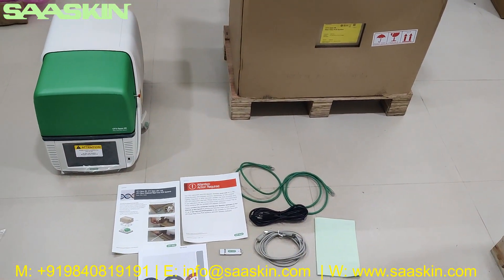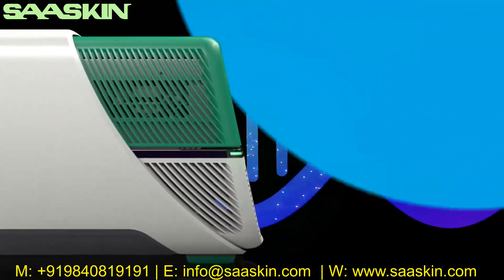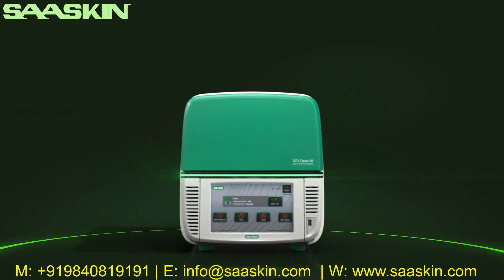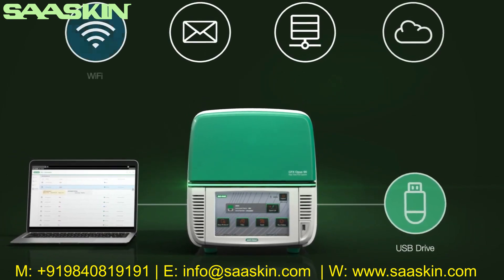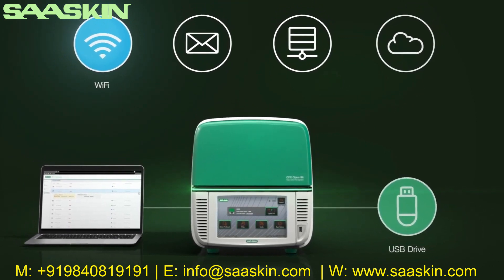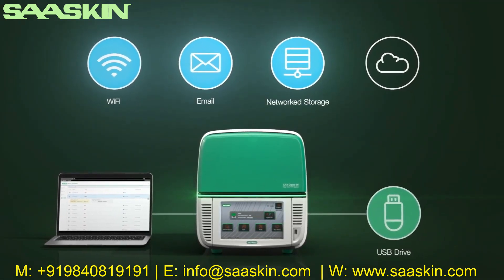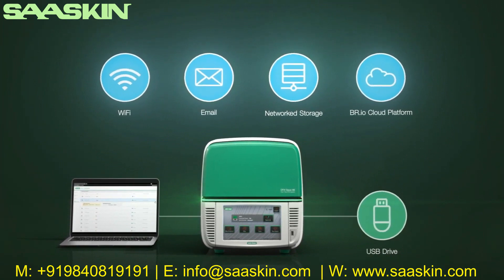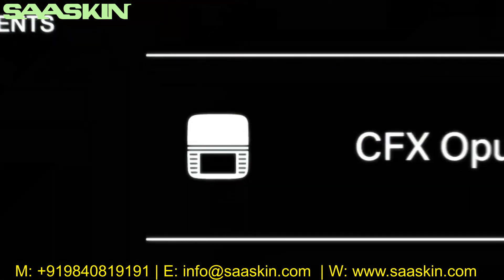Introducing Bio-Rad CFX Opus real-time PCR systems — modern connectivity with more flexibility than ever. CFX Opus can operate in a completely wireless environment, in addition to Ethernet connectivity and direct data transfer via USB. Connect with Wi-Fi for wireless access, program data and notifications sent directly to your email. The new network drive allows you to save and share data locally, and the system can link to Bio-Rad's BR.io cloud platform for remote setup, instrument monitoring, and data management.